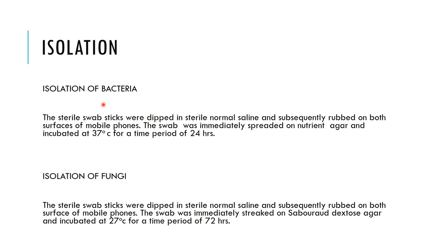We then repeat this process after using the disinfectant. After applying the essential oil-based disinfectant using a spray bottle, we again swab the phone and spread the sample. For bacteria, we spread it onto Nutrient Agar media, and for fungi, we spread it directly onto PDA media.